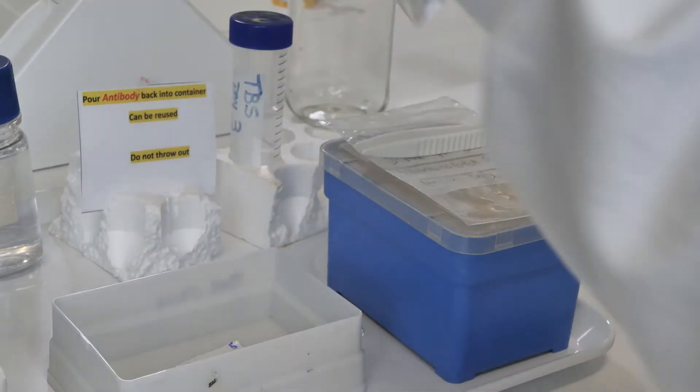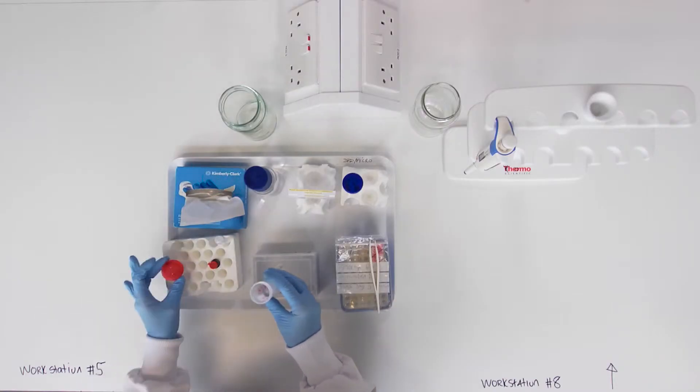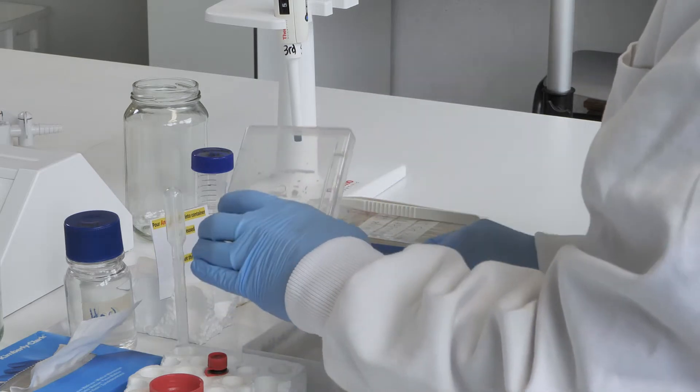Add 15ml of the antibody solution to the membrane. Rock at room temperature for one hour.